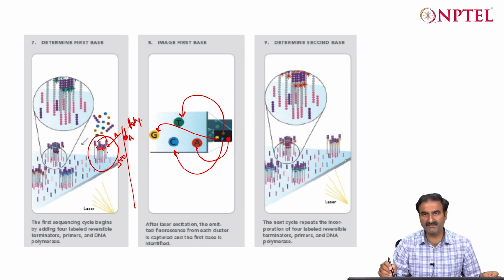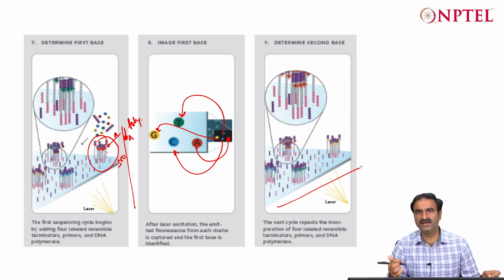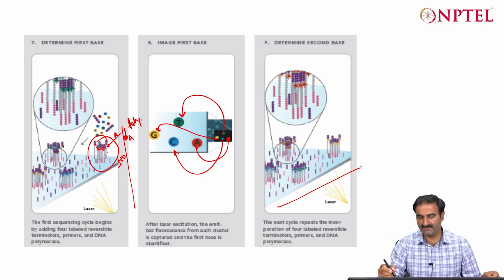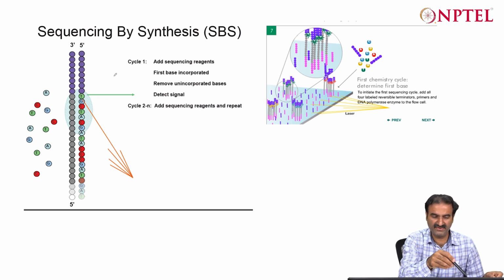This way I will be doing massively parallel sequencing throughout the flow cell. You can imagine there are more than 100 million fragments attached on this flow cell, giving any of the 4 color lights. Imagine a field where people are standing in clusters and glowing bulbs. Sometimes they will glow A, sometimes B, sometimes C. Their position is fixed, it is not that a cluster will move. So in XY coordinates, in two dimensions, this position will be fixed. Whatever light I get from here at the different cycles depends upon which nucleotide got inserted into that DNA. This way I'll keep on inserting nucleotides.